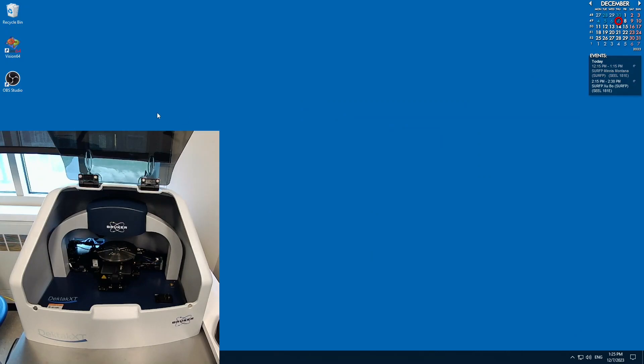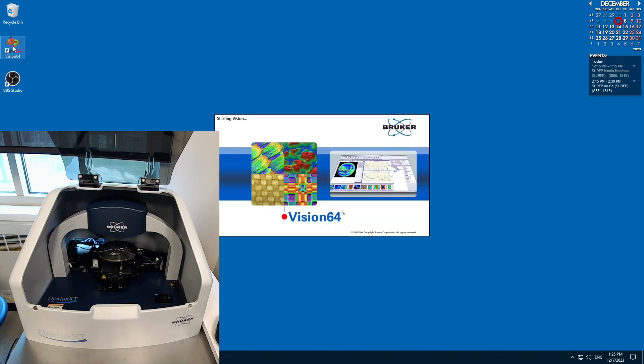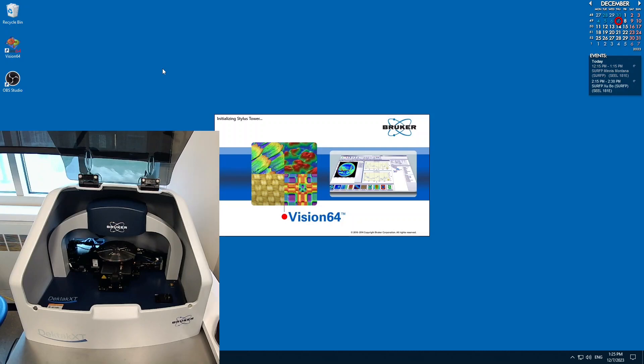Today we're going to show you how to use the Surface Profilometer. It's a Stylus Profilometer. Start by opening the Vision64 software on the desktop.